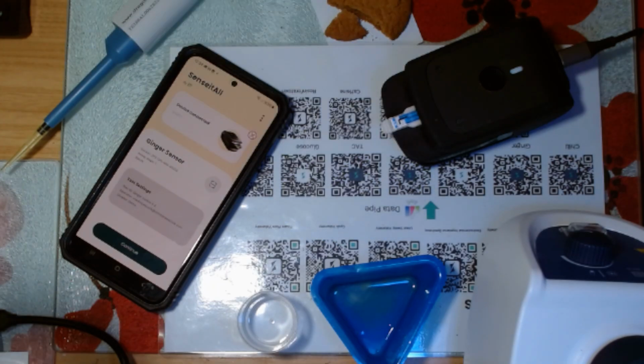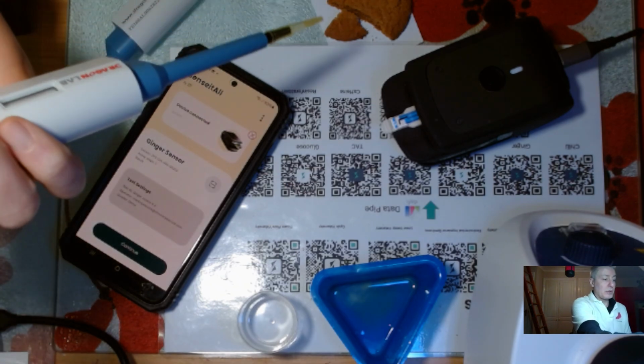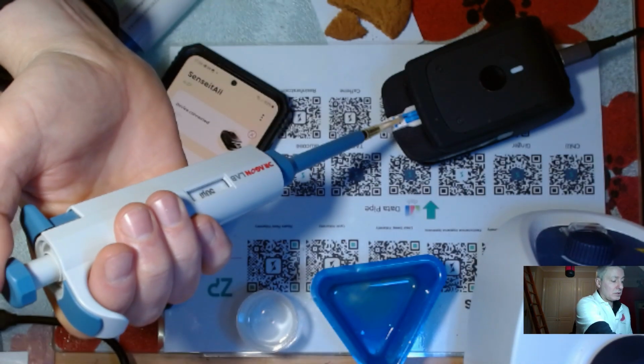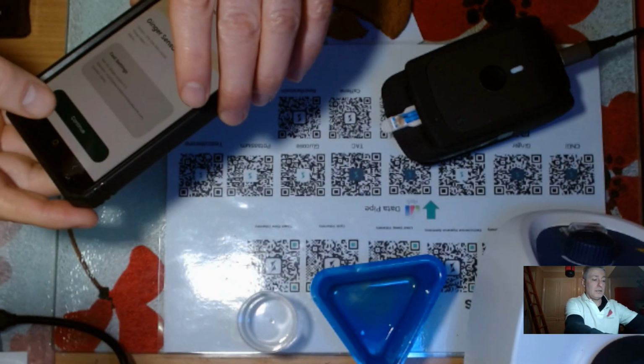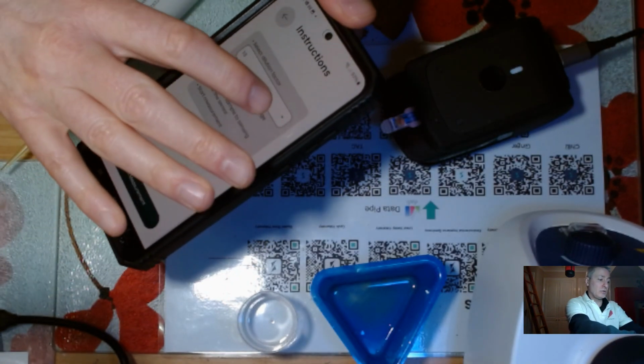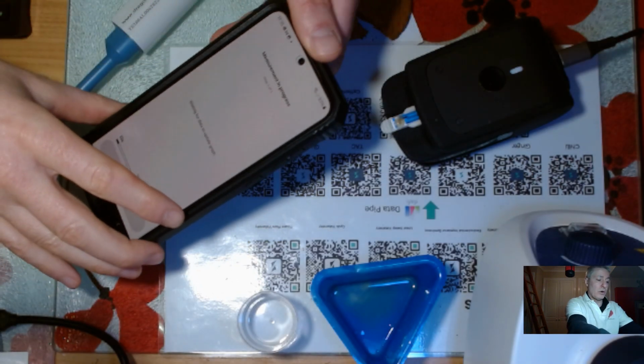The reason I've done a 1 in 5 dilution is because with ginger root, I do a 1 in 10 dilution. If I'm doing ginger powder, I do a 1 in 100 dilution. But a ginger biscuit is not as pungent as a ginger root. It's going to be an order of magnitude less. So I will put my drop on like that. I'll make sure that I choose the 1 in 5. So I'm doing that, start measurement, and off it goes.